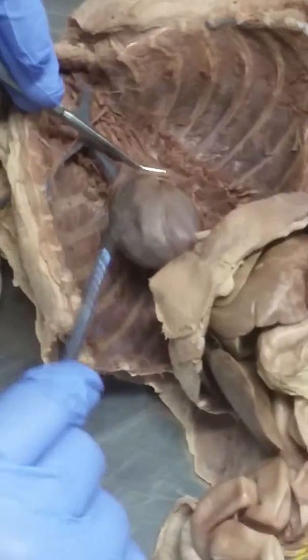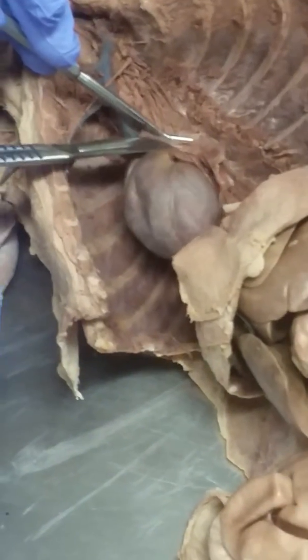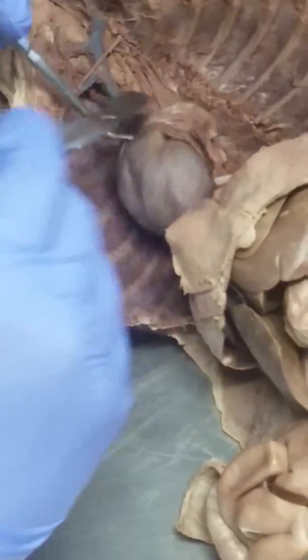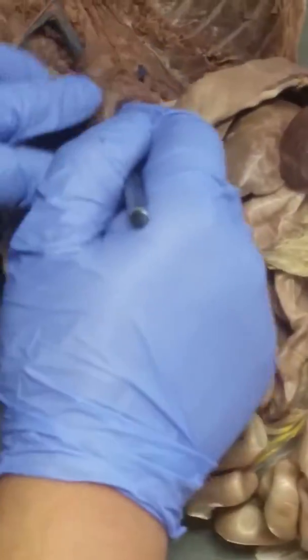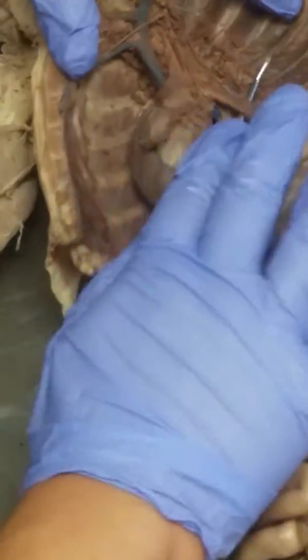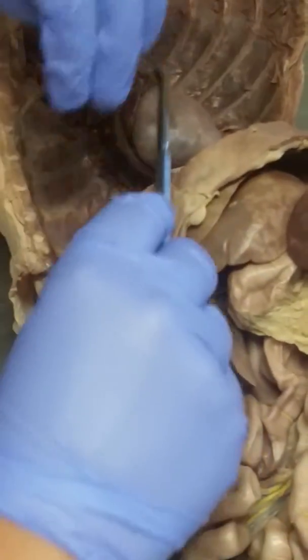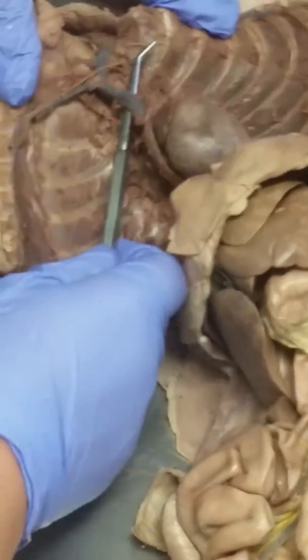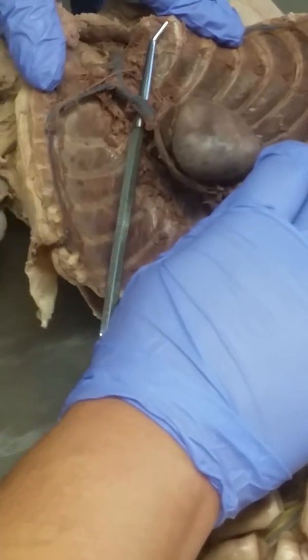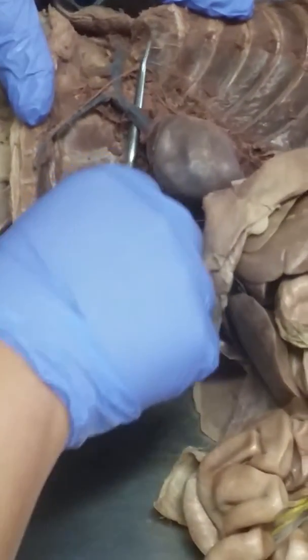See that? See this vessel right there? That's the pulmonary trunk. And that's going to go to the lungs. If I go now right behind it, now we see this vessel. What vessel do you think this is? That's the aorta, right? So this is in the middle. And if we go behind the aorta, now we see the superior vena cava, right? 1, 2, 3. Superior vena cava, right?